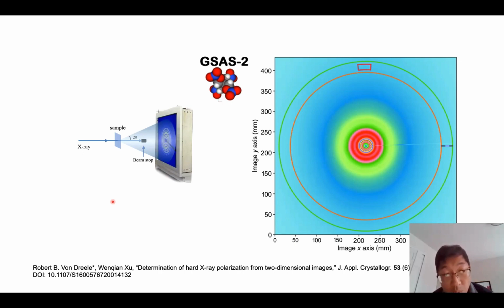Throughout the years, Bob, Brian, I, and Andrey, another beamline scientist at 17BM, had many discussions on how to make GSAS-II's image processing more adapted to beamline operations. And Bob and Brian have been really accommodating, and they built quite a few powerful functions that are really beneficial to our users, such as automatic image integration and also wavelength calibration. Here is another function: getting polarization factors.